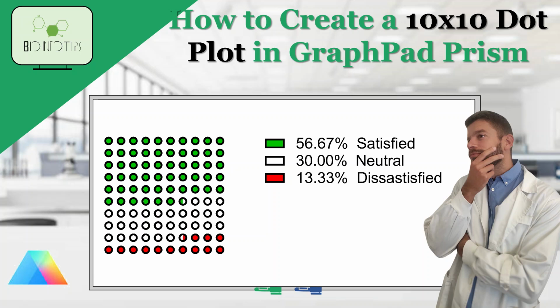Do you want to know how to make a 10 by 10 dot plot on GraphPad Prism? You came to the right place.